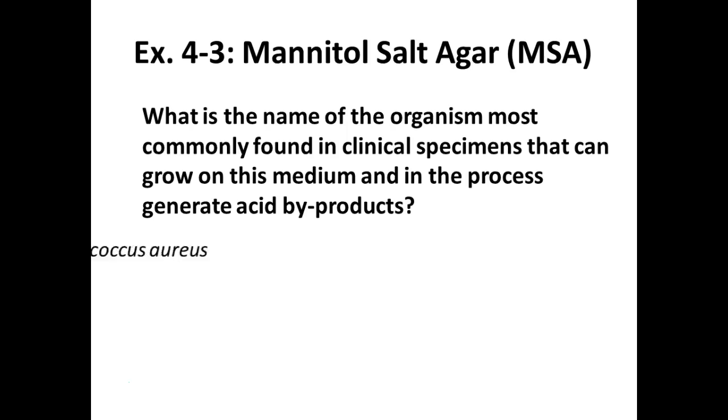Staphylococcus aureus. So who's got Staph aureus? Who's got the yellow plate? That's you. So Carolyn's got Staph aureus. I bet before today you knew you had a staph, but you weren't quite sure which one, right? Well, you told me last time. Oh, I did. Okay. You were probably able to narrow it down with your methyl red VP because they came out right. Cool.